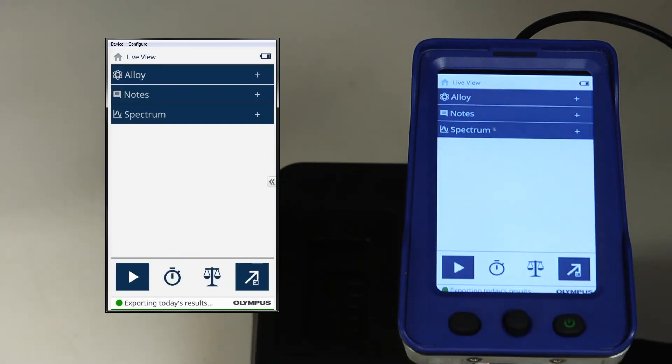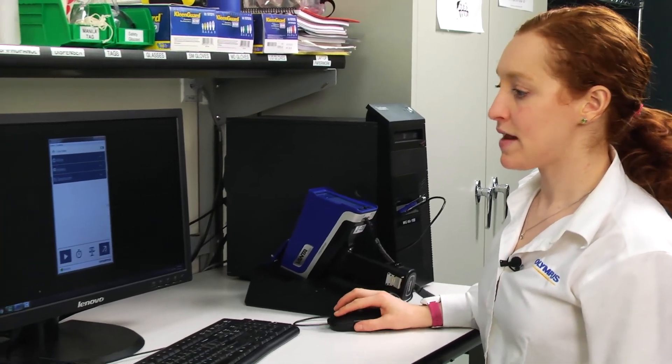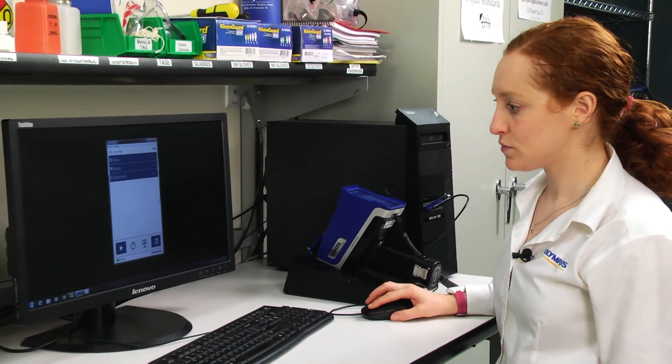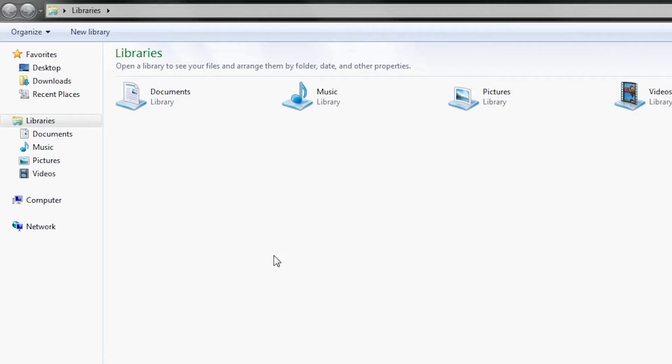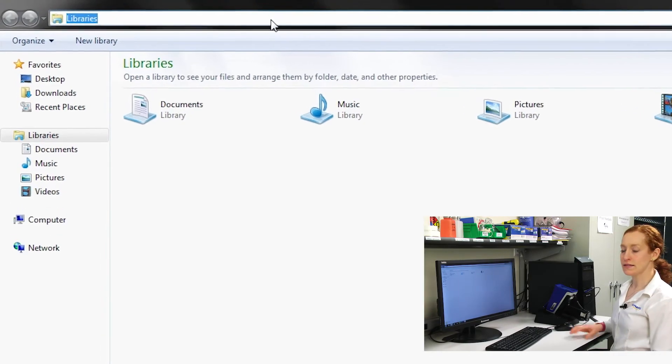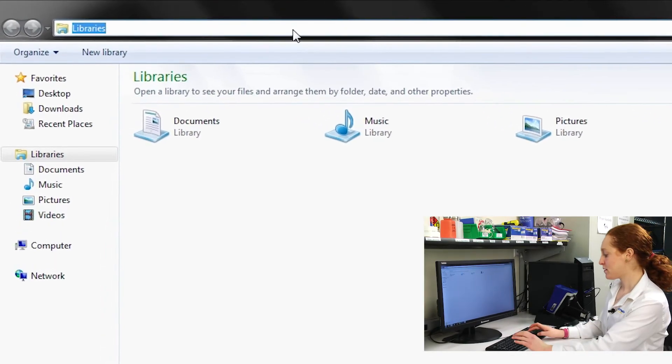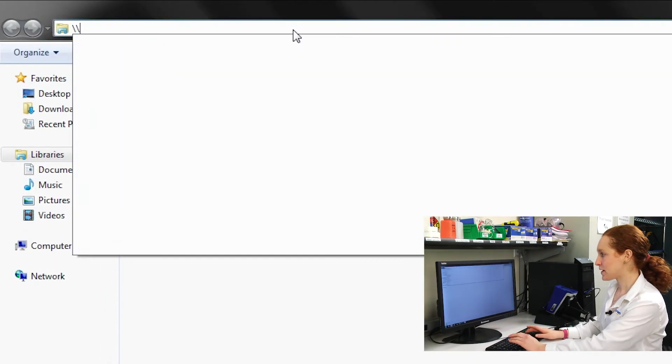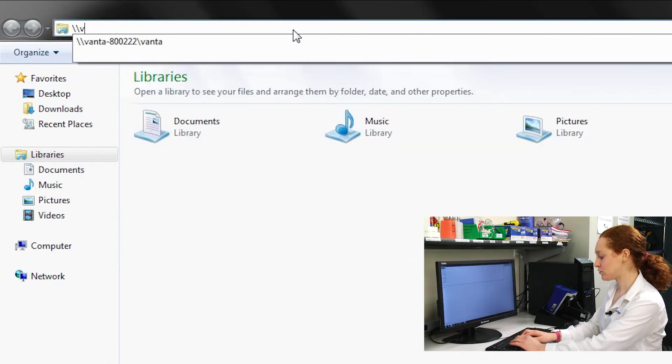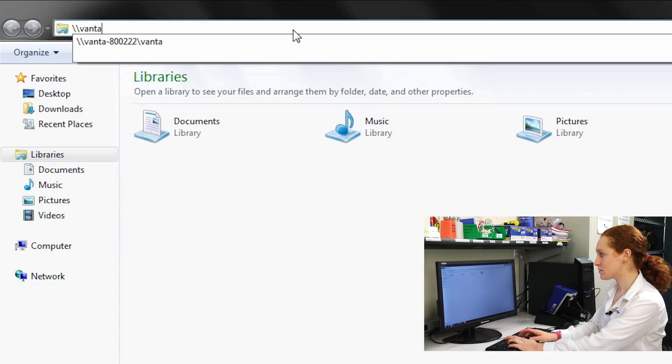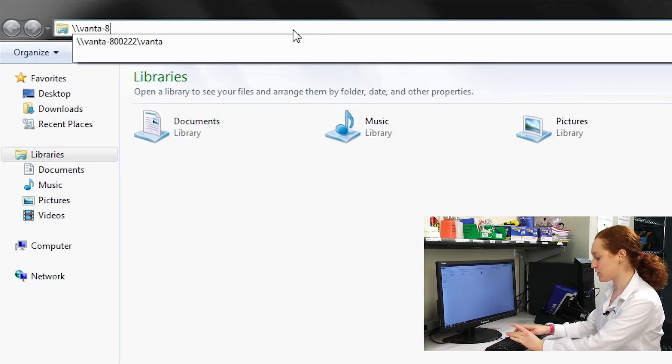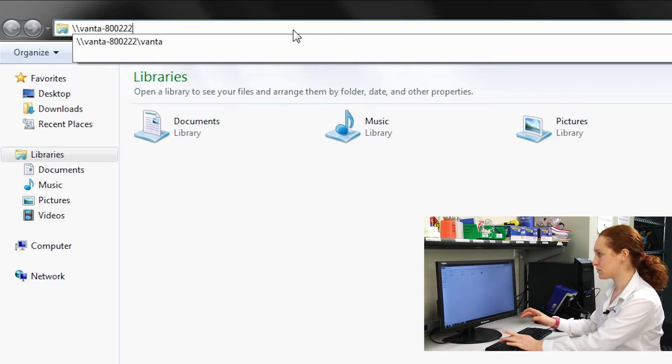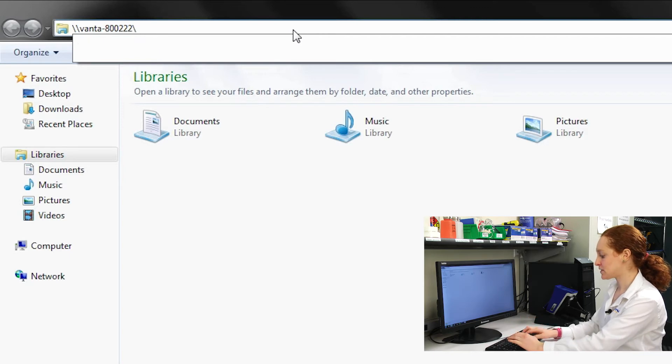Once it's complete, I can navigate to Windows Explorer and type in backslash backslash Vanta dash my Vanta serial number backslash Vanta.